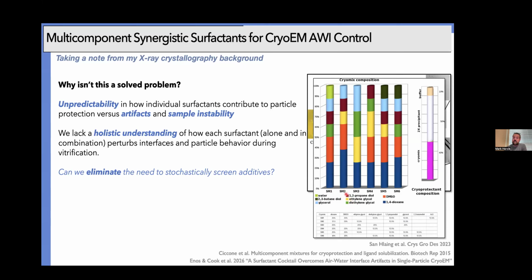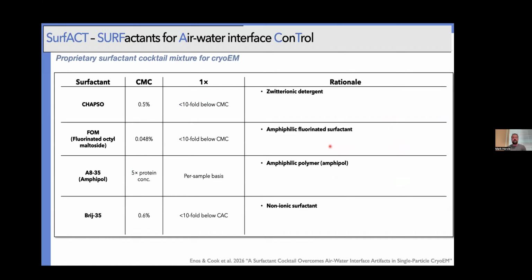But rather than having a single high concentration of one, they had low concentrations of all of them. And what they observed across the board was big improvements in the number of targets that worked well with it. You had decreases in the number of ill side effects from a single cryoprotectant, and your screening became limited because you didn't have to go through each individual cryoprotectant at high concentrations.